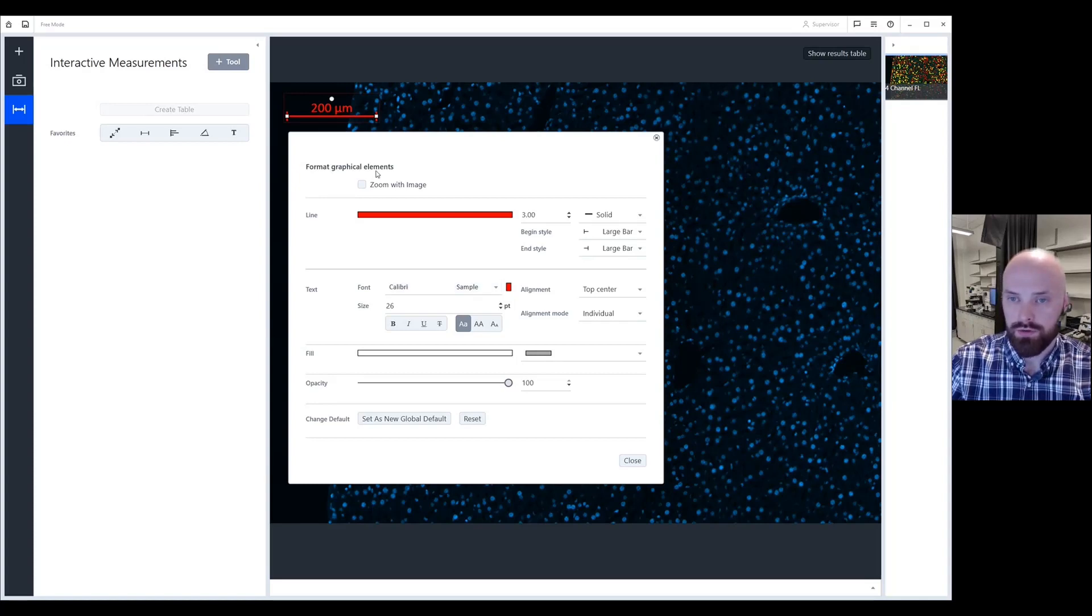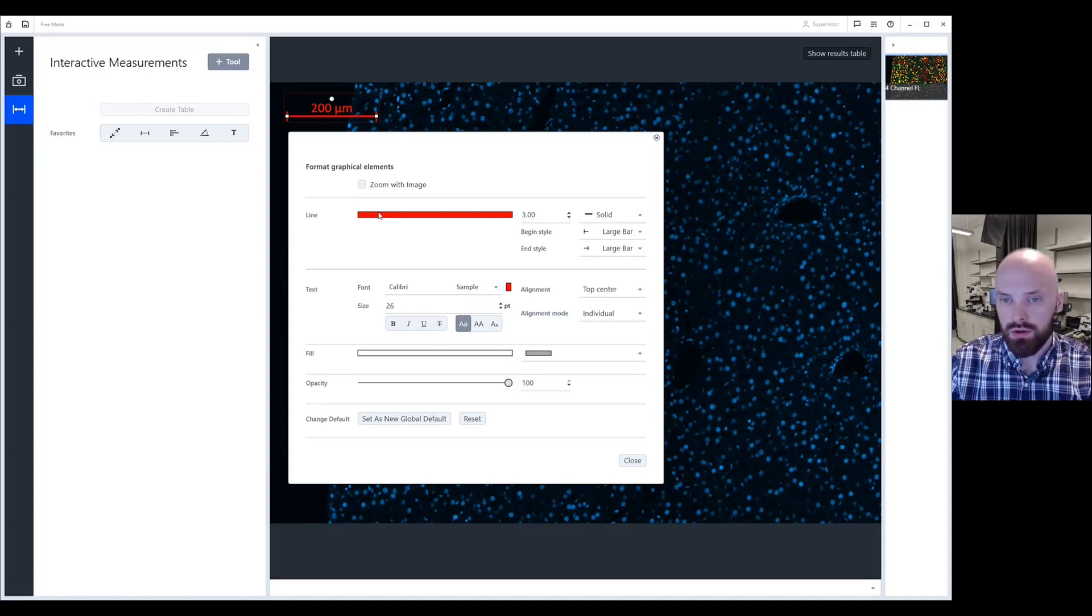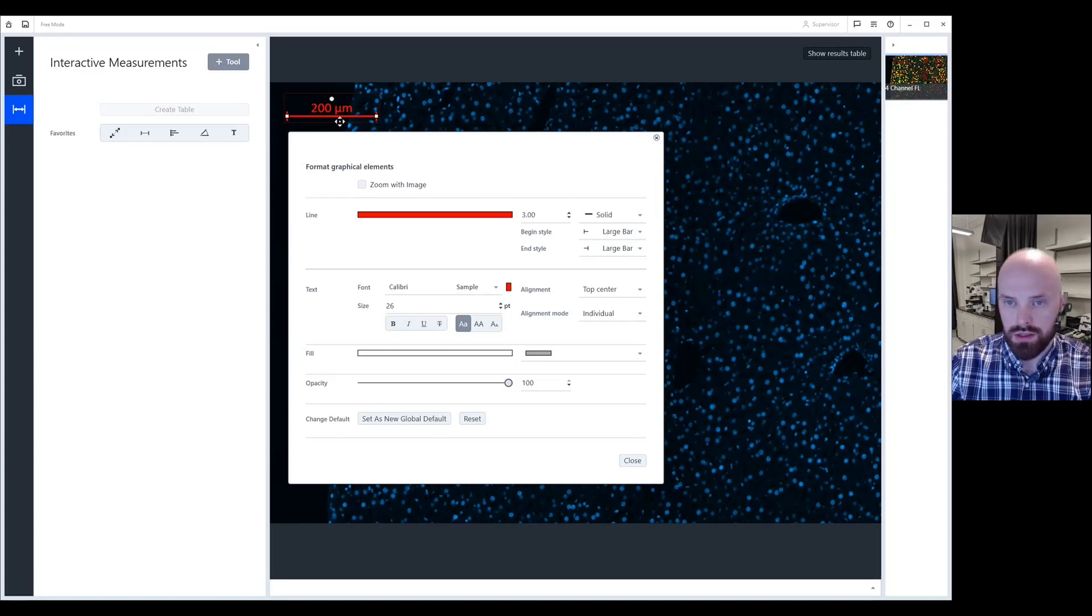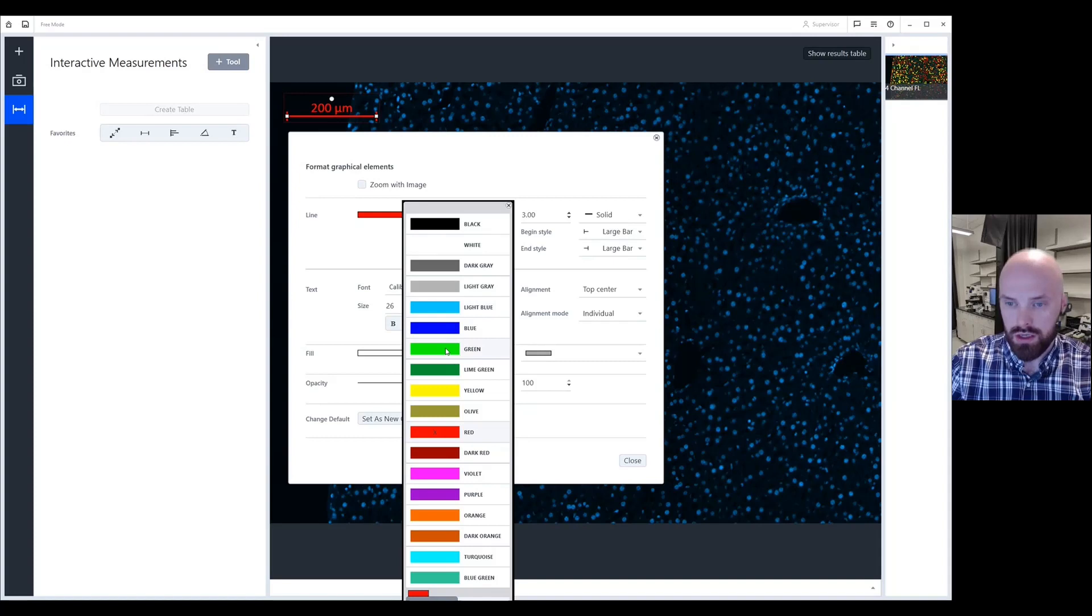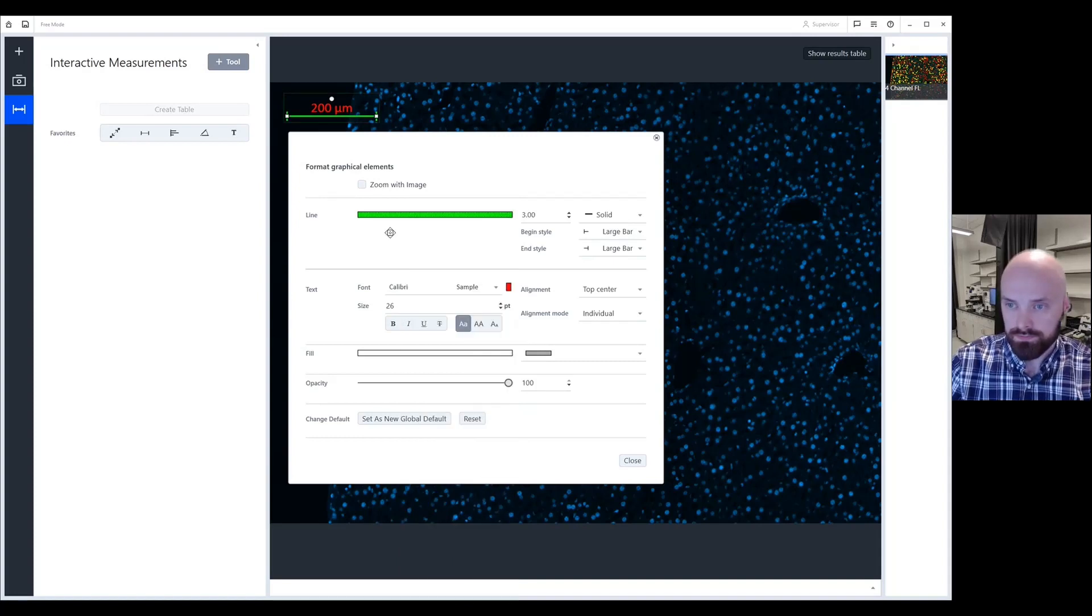Starting from the top to the bottom, under the line settings, here's all the settings you can change to the line itself. So that's this bar right here. By clicking on this bar, this allows you to change the color. So let's say I want to make a green scale bar.